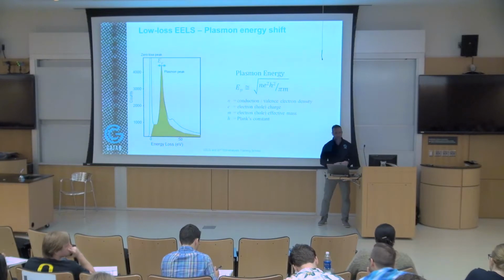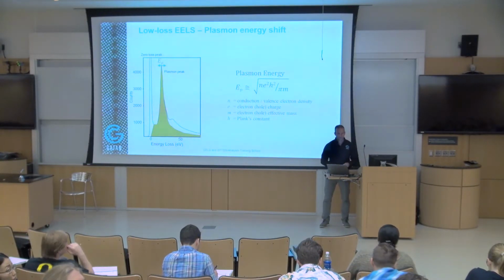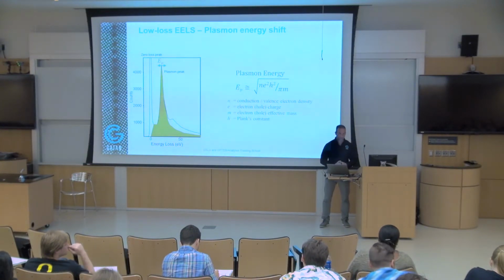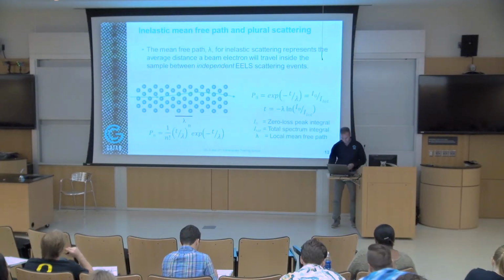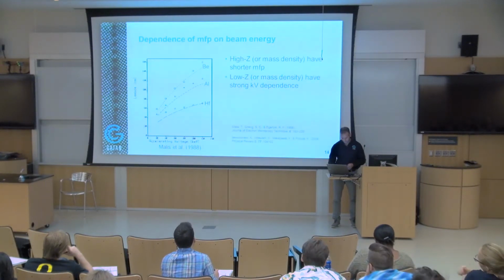Yes. So when you are calculating thickness from the zero loss peak, you are calculating the total intensity of the spectrum. By total intensity, what do you mean? The intensity of the edges or the intensity of the whole spectrum? Yeah, let me get the slide.